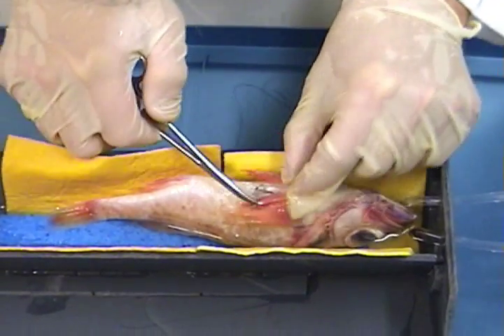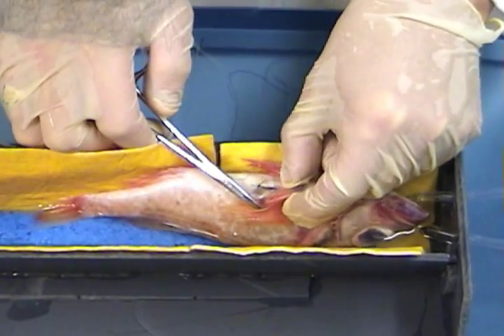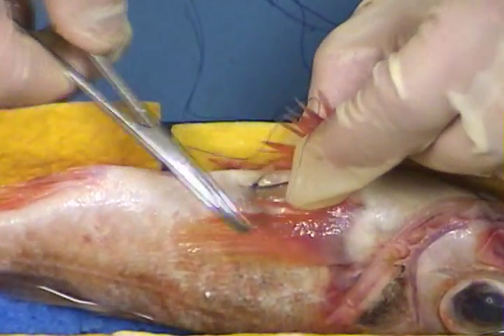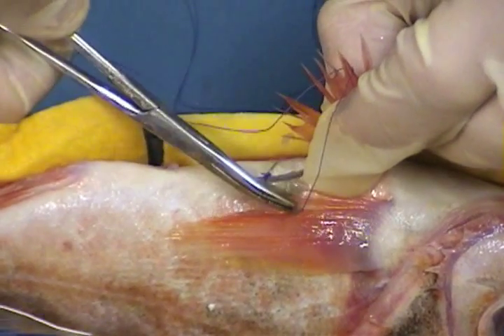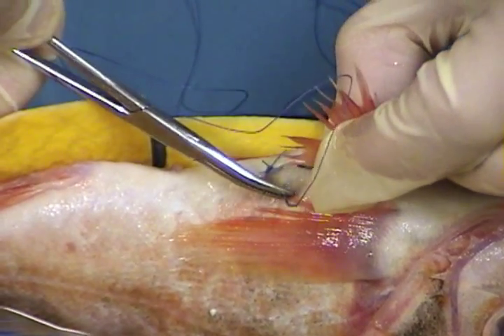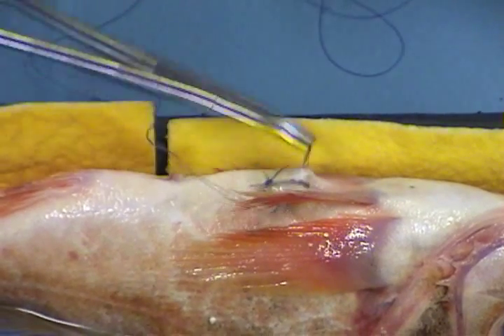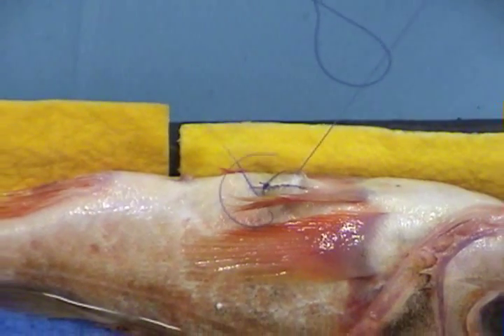To do the second stitch, repeat the same procedure that you used for the first one. Be careful not to over tighten the first knot so that you don't cut the tissue, but the knot should be snug so that the knot doesn't loosen. After some practice, you will be able to do this surgery quickly and your stitching will be very consistent.